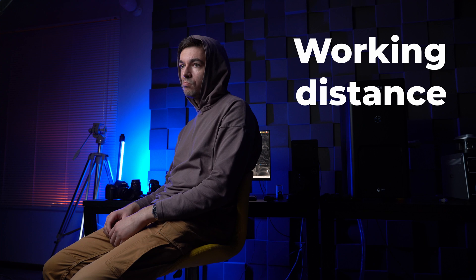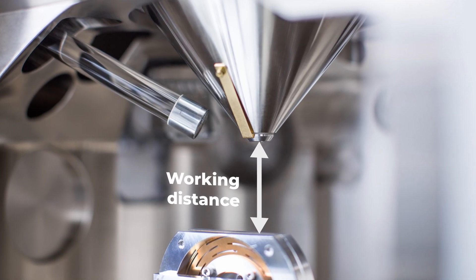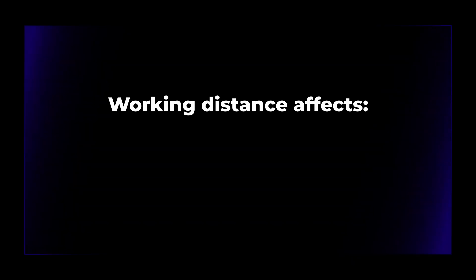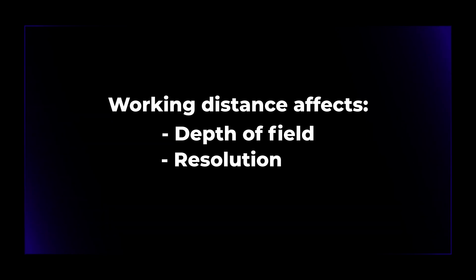I'm sure I forgot something. Yes, I forgot about the working distance while recording the video. The working distance is the distance between the bottom of the column and the top of the sample. This is a very important parameter for two reasons. The first is depth of field, the second is resolution.